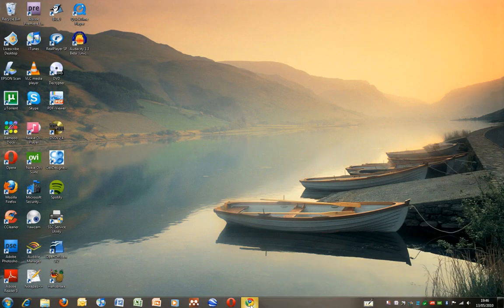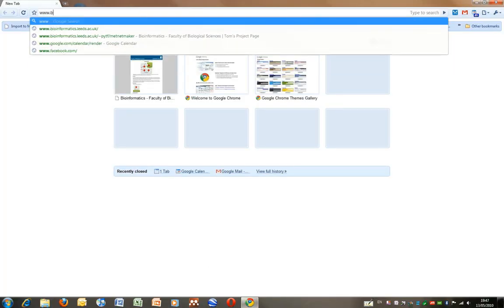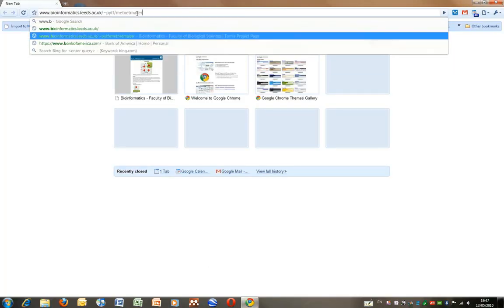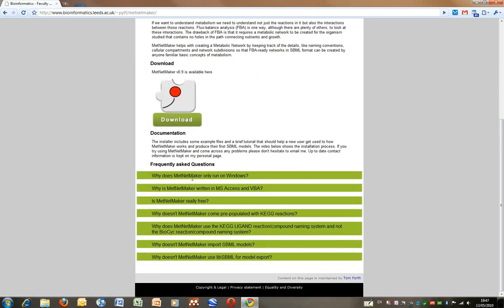So in this video I just want to quickly show how to install MetNetMaker. The first thing to do is go to the website, which you'll probably have already found if you've managed to download it. And it's worth noting that on the website there are some frequently asked questions at the bottom.